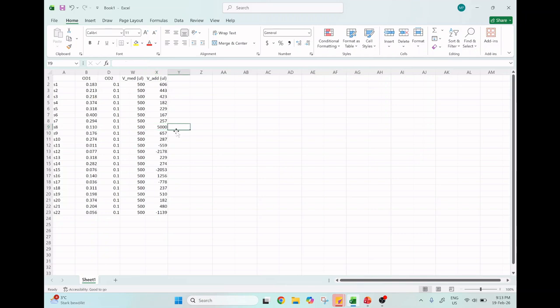So what you want to do is obviously choose this value here smartly, so the amount of liquid that you put in your tube ahead of time. Because unlike in the classical case, here the volume that you will end up with varies. In the classical case, that's always the same. So here you may just exceed the amount that you can put in your tube.